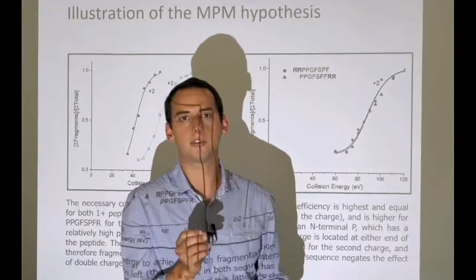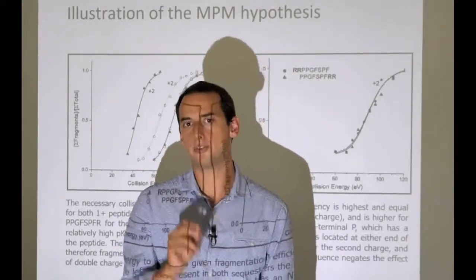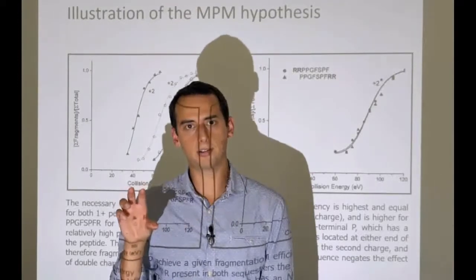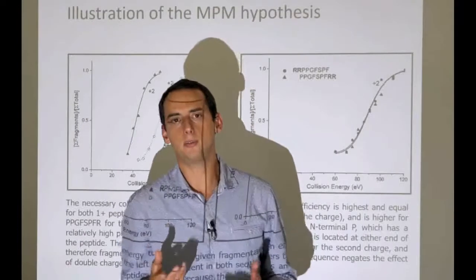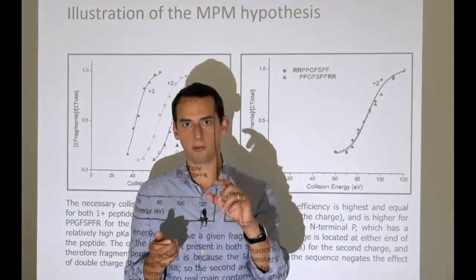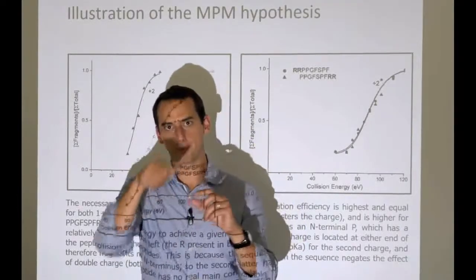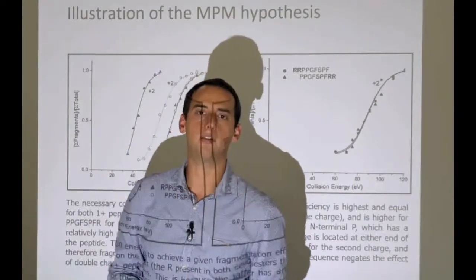These B ions are actually very unstable. If you go back to the previous lecture and have a look at the structure again of these ions, you will see that they end on a CO. But usually we don't see these kinds of bonds. Usually our carbon has a double bond to the oxygen and then has another bond to another group, and then of course it has the bond that links it to the alpha carbon as well.